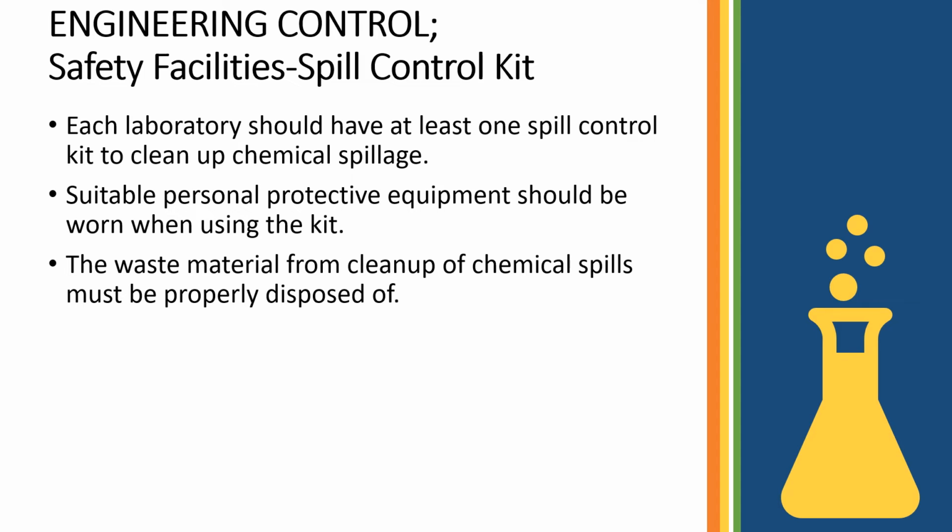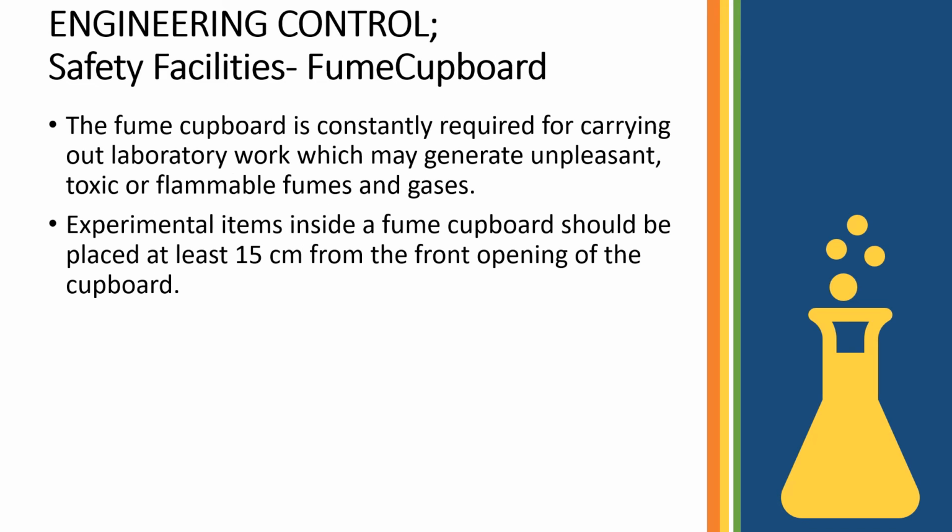Engineering control, safety facility: spill control kit. Each laboratory should have at least one spill control kit to clean up chemical spillage. Suitable personal protective equipment should be worn when using the kit. The waste material from cleanup of chemical spills must be properly disposed of.